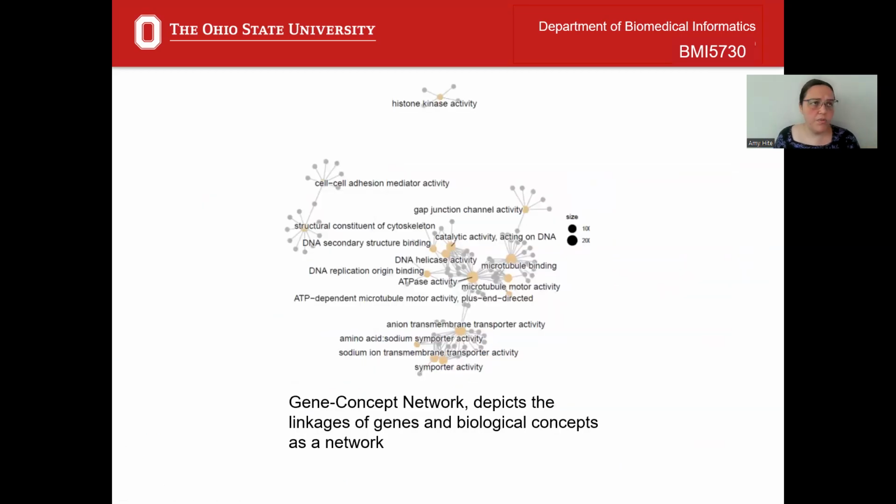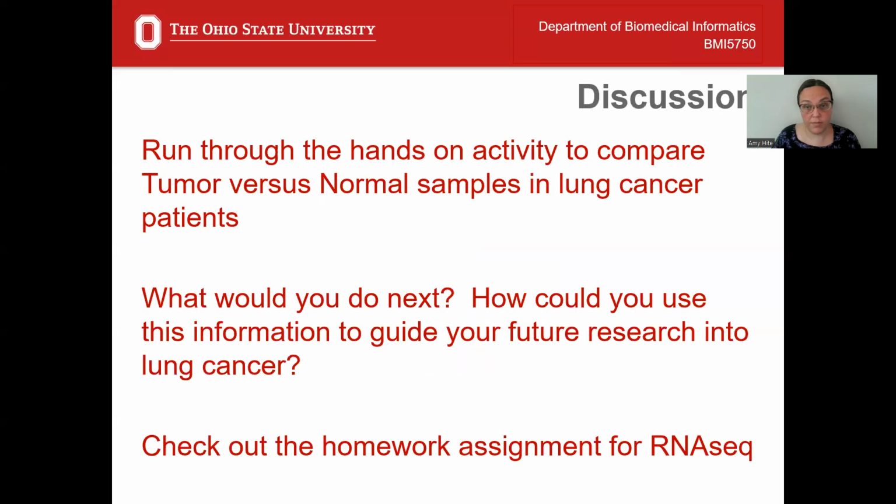The clusterProfiler can also make these gene concept networks so that they can show structural constituent of cytoskeleton is related to cell-cell adhesion mediator activity based on one gene. These are both terms that are enriched in our data set. So there are a few different ways of visualizing the functional enrichment results that we get out of clusterProfiler.